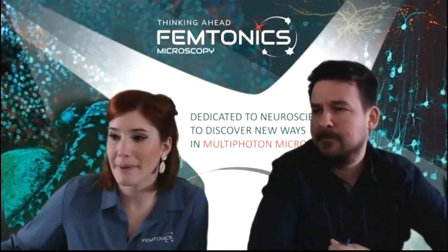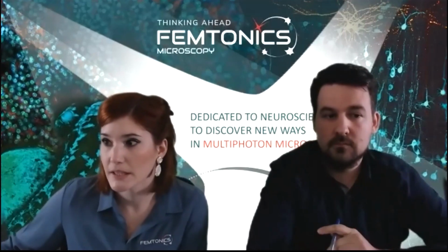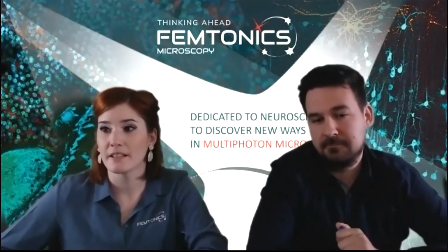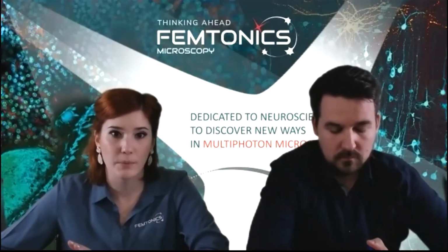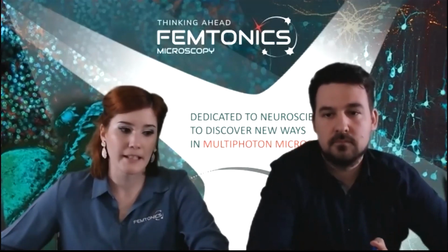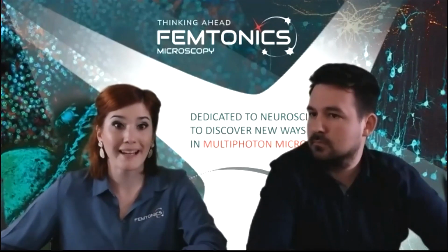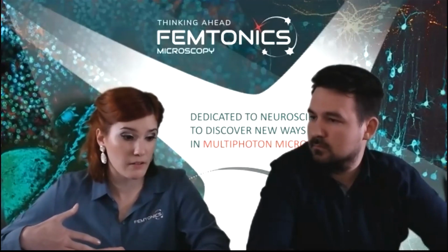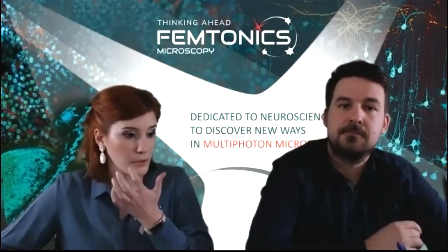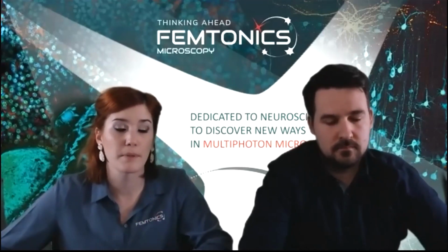Is it possible to combine tilting objective with piezo z-axis on FEMTOSmart? Yes, it is possible. In the tilting mode, you can select the option to perform z-stacks with the piezo orthogonally. And we have many users who are combining these positioners together.